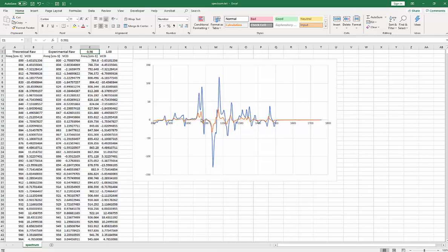We said we're going to scale back by about a fourth or a third. So let's put that in here as 0.26. We'll try that first. And magically the spectra is aligned quite nicely. This would probably be very good for a fit. So we can change these numbers as much as we want manually until we get the fit that we want.